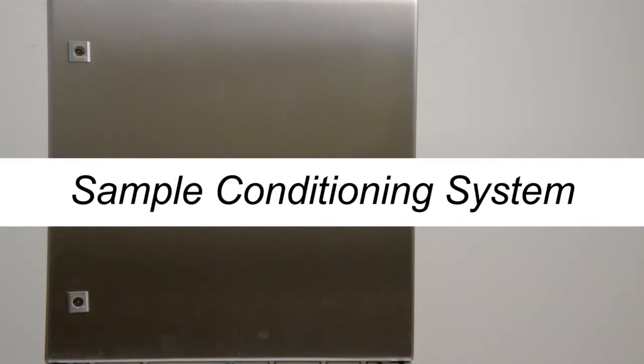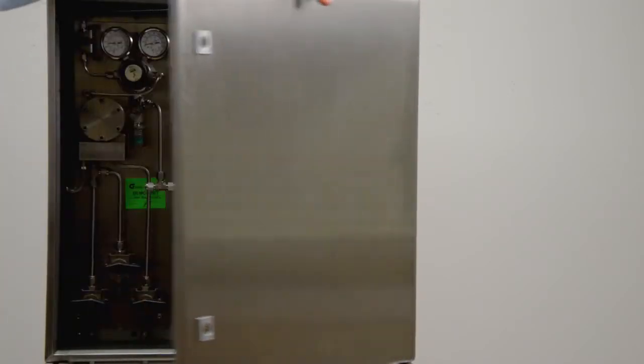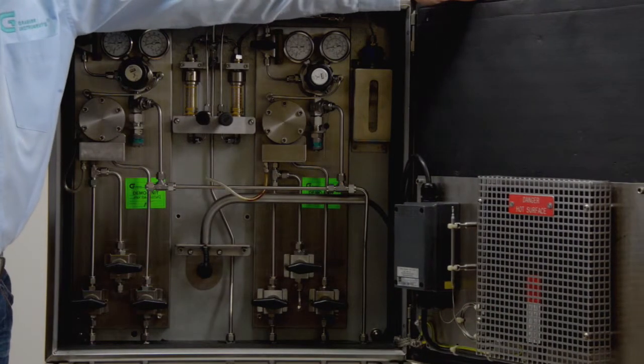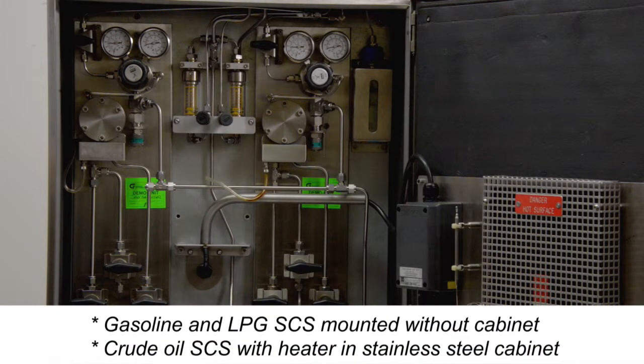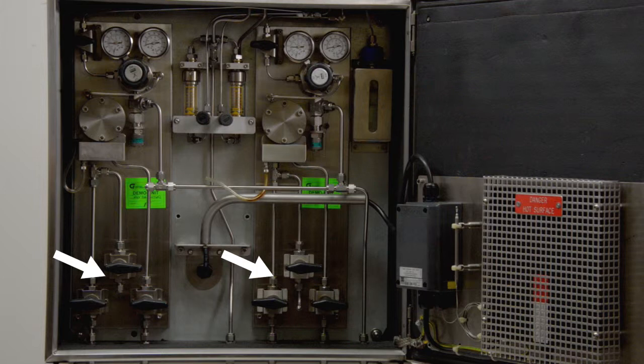Sample Conditioning System. The SCS is located at the bottom of the measuring cabinet and can handle pressures up to 7,000 kPa. A gasoline and LPG SCS is usually mounted without a cabinet. A crude oil SCS is contained within a stainless steel cabinet. Two streams for gasoline, LPG or crude oil can be connected. The third valve is for the calibration liquid.